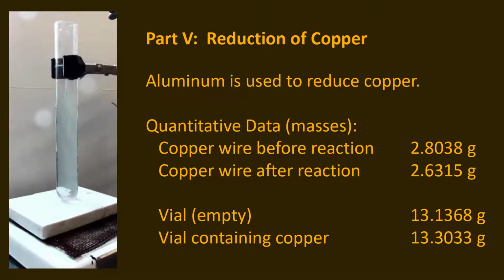copper that's left on there, which is one of the reasons in this particular procedure, as with any procedure, when you're trying to recover something, sometimes there's material that you don't have, and you just sort of have to shrug and say, yeah, that's the source of error. That's where our potential quantitative loss is coming from. Actually, it's not potential; it's certain that loss is coming from there.